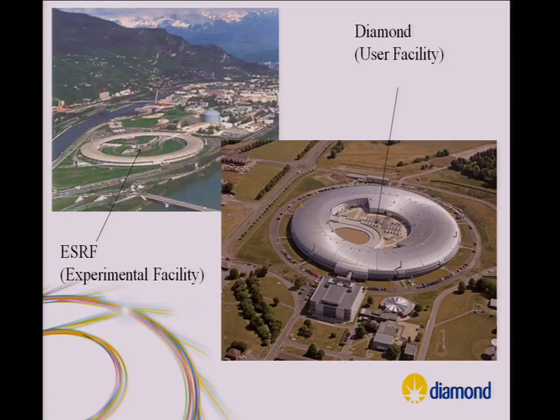Are other facilities using this? Do you know what other people are using? I guess my question is, what's their technological approach? I think Python's quite popular in general. I know ESRF are doing Python visualization as well. All the GUI is in Python, PyQt, Python visualization. There's not that many in Eclipse RCP. There's some activity in America, but also a lot of Python over there as well.